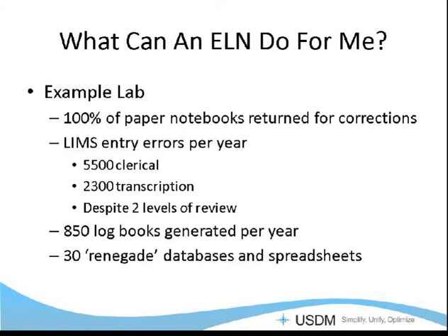In our analysis of LIMS entry, we found 5,500 clerical errors, 2,300 transcription errors, and this was despite the fact that there were peer and supervisor reviews on everything. This is in a lab with a sample flow of about 30,000 samples per year. They also generated 850 logbooks per year, a lot of duplicate entries.